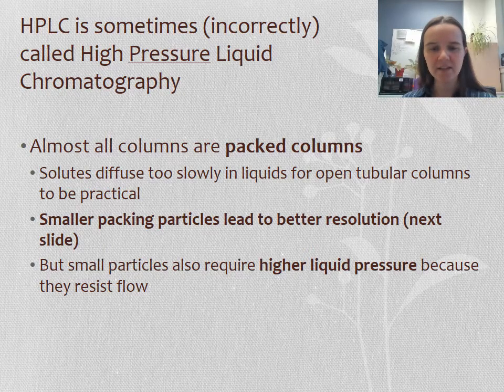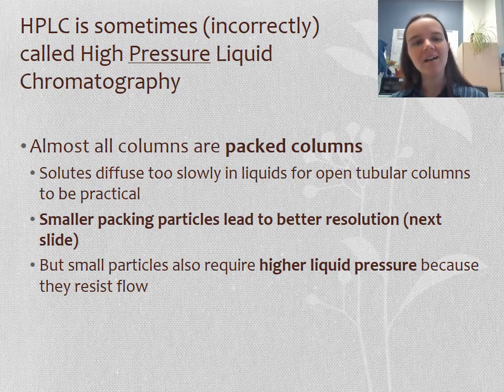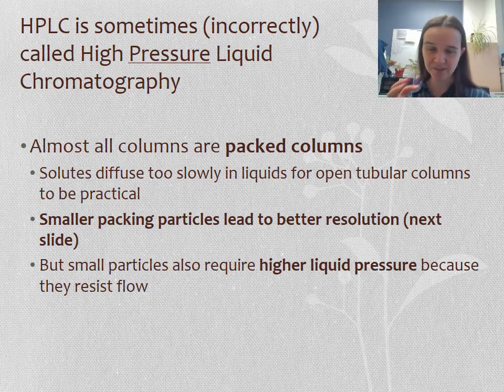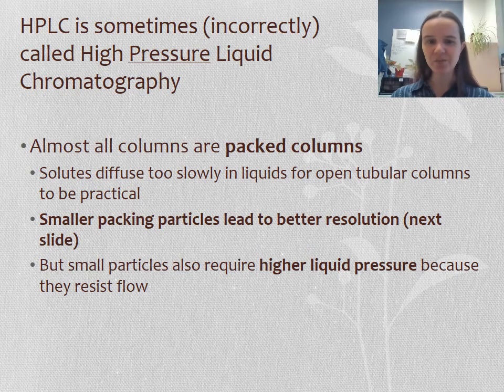With this packing, if you have smaller packing particles, you get better resolution. So we're always worried about better resolution, and I'm always interested in making sure you know what makes better resolution. Smaller particles do that. But a smaller particle is also going to resist the pressure more, so you're going to require a higher liquid pressure with those smaller particles. But that's not insurmountable. We can totally handle higher pressure.